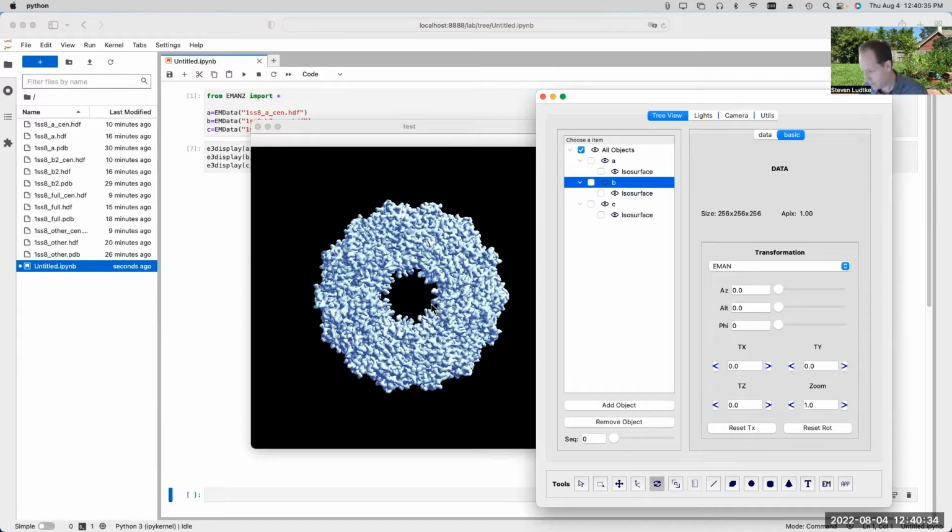So to do that easily, I probably would have wanted to pick a subunit which was oriented already on the x-axis. So if we want to do that here, we're going to have to be a little trickier. So I want this rotation to basically rotate towards the middle. So the first thing I need to do is figure out what orientation is going to put that roughly on the x-axis.